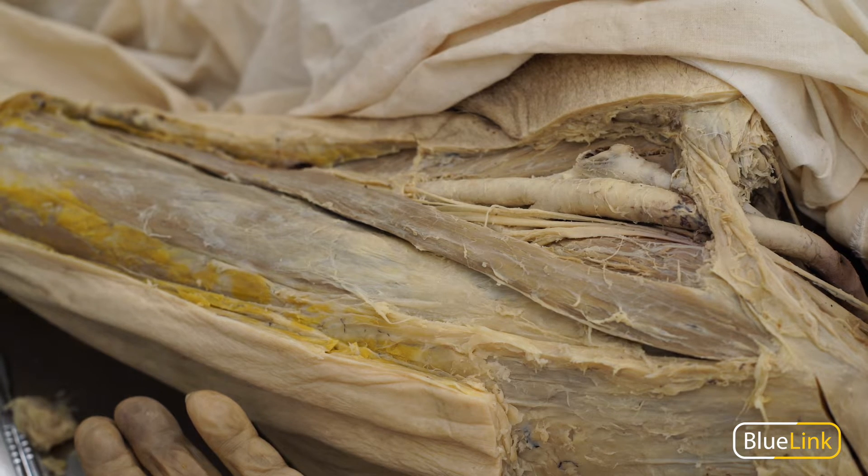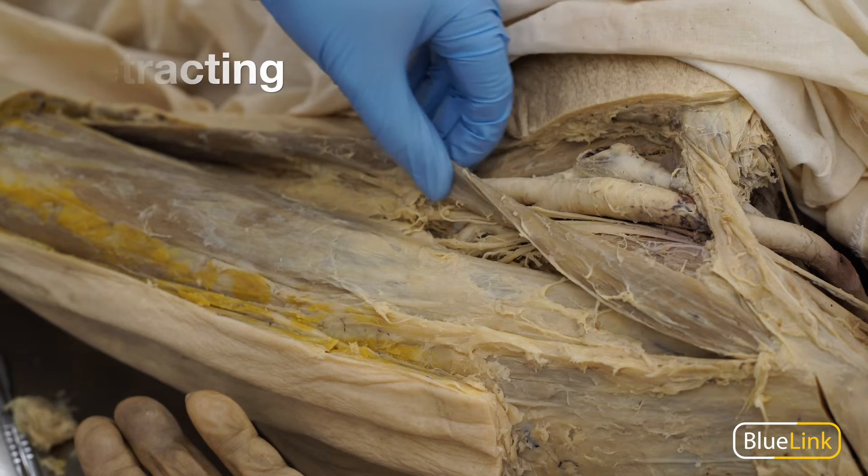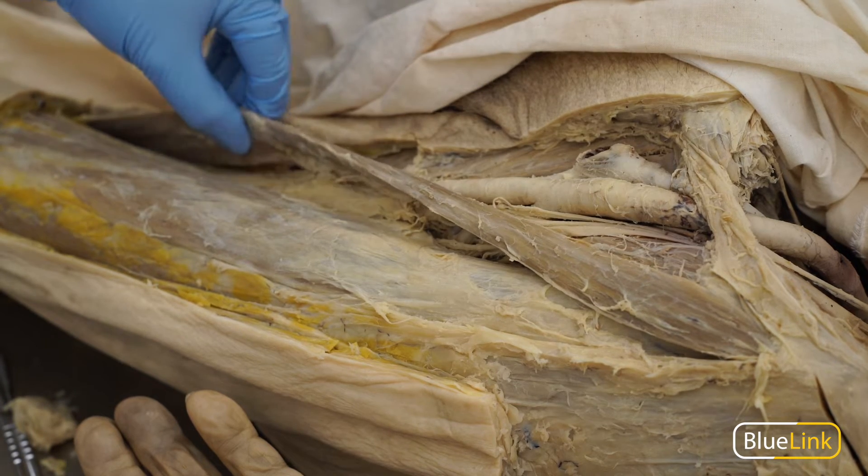Oftentimes while dissecting, muscles will need to be reflected or retracted in order to find deep neurovasculature. Retracting a muscle means to move the muscle from one side to another in order to view what lies deep to it, but without cutting the muscle.